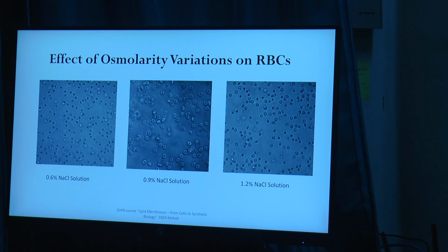Okay, so we will be giving you the micropipette and the micropipette tubes. Please add 100 microliters of the whole blood, the blood solution, and 400 microliters of the saline solution of your concentration. Do that and incubate it for 15 minutes.